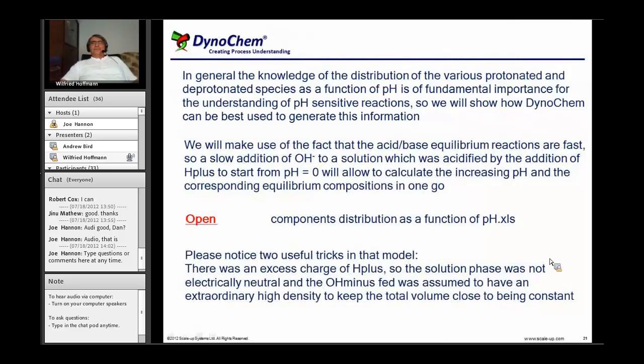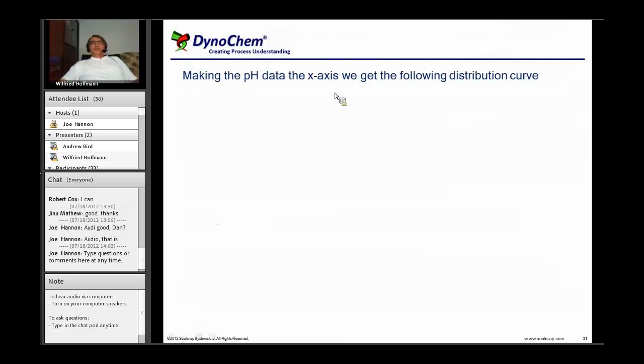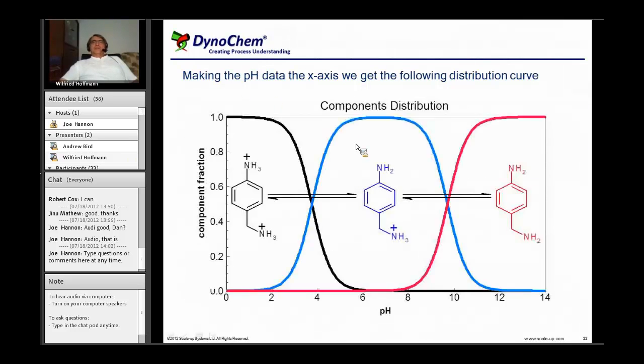These are the tricks I have. Making the pH data the x-axis, we get the following distribution curve. Now you see where the species are. You see at the right-hand side where the alkaline region, high pH, both nitrogens are able to get product, so both nitrogens can attack the acetic anhydride. It's only a matter of the competing reactivity.